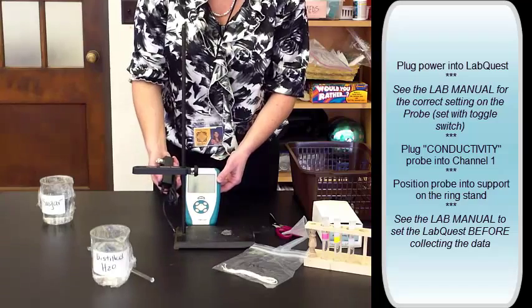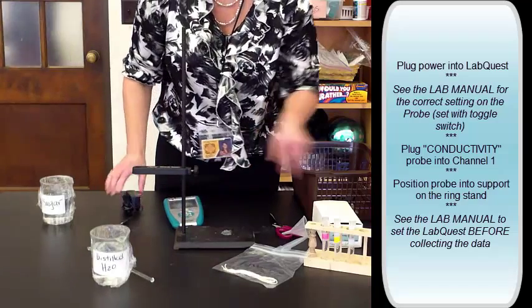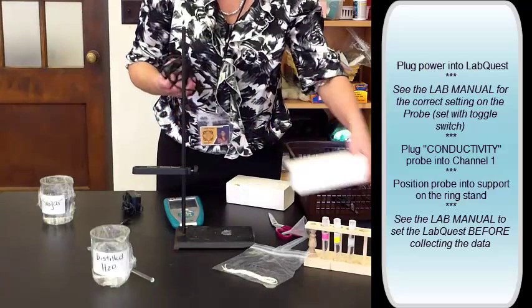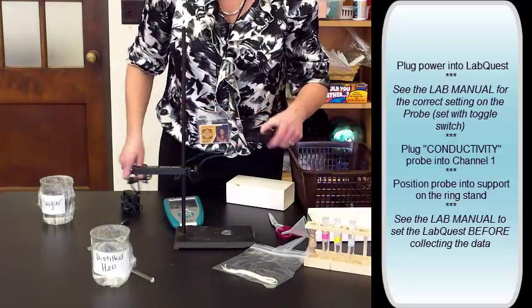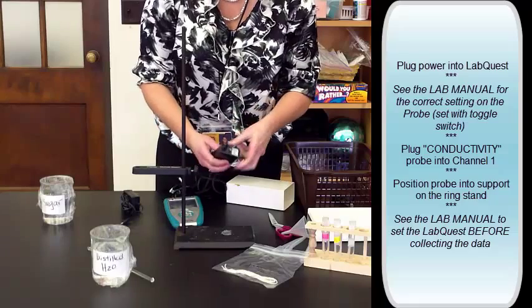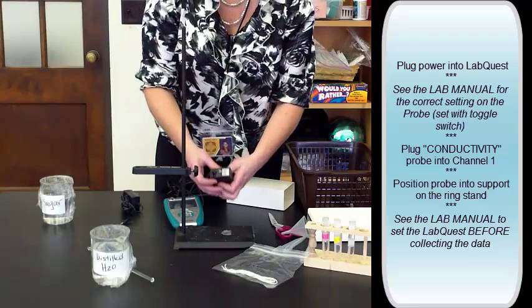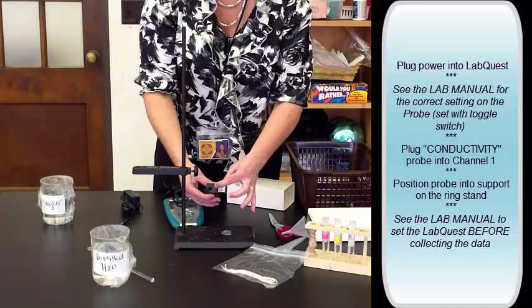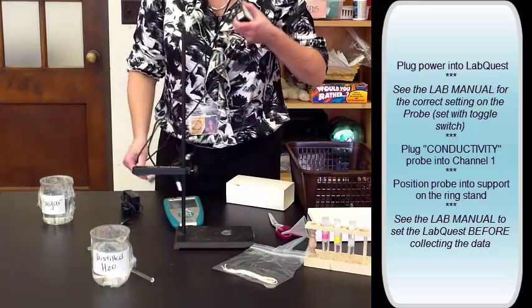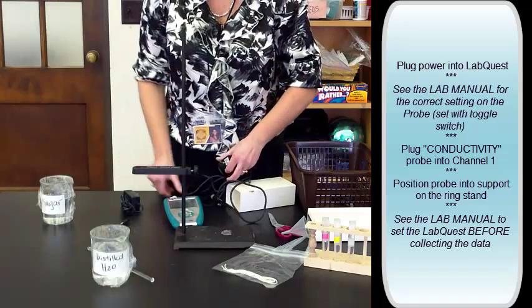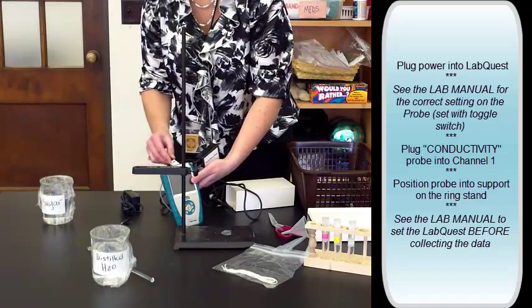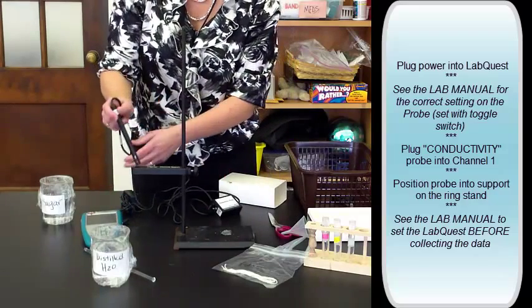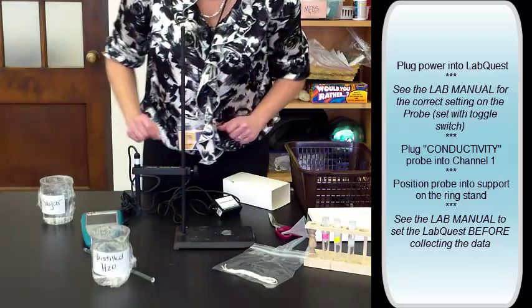You'll plug in the LabQuest like you've done before for power. Now the conductivity probe, there's an extra setting, and it's all in the box that goes between the power and the probe. So look in the lab manual so you know which one to set it on. This toggle switch gets moved a lot. So we're going to plug into channel one, and put the probe in the support, and then we're set up.